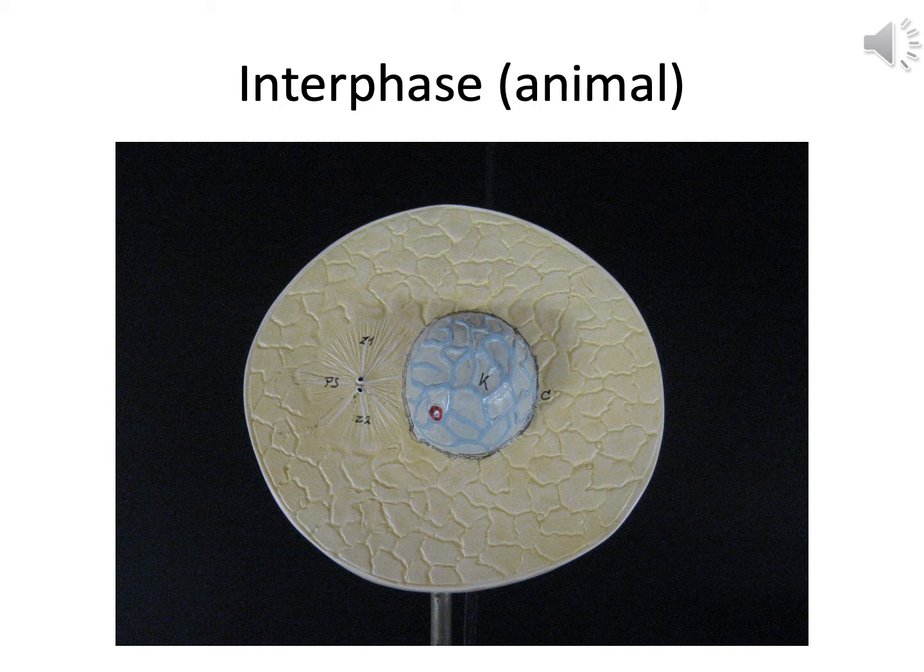During interphase, first of all, the nucleus is distinct. On the picture, you can kind of see the little gray ball where somebody drew a nuclear membrane with a pencil. I threatened to, it wasn't me. Chromatin is present. See these slightly medium blue stringy things that are in there? No, they're not real easy to see. That's the chromatin that's present.